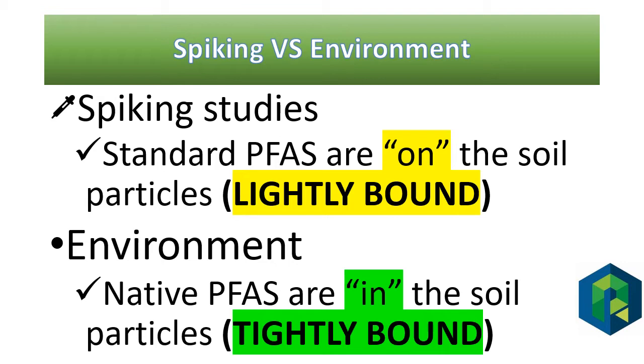And I like to use the term lightly bound. In contrast, PFAS in the environment are more in the soil particles. And you could use the term they're tightly bound. So we have this contrast between PFAS that are lightly bound and PFAS that are tightly bound.